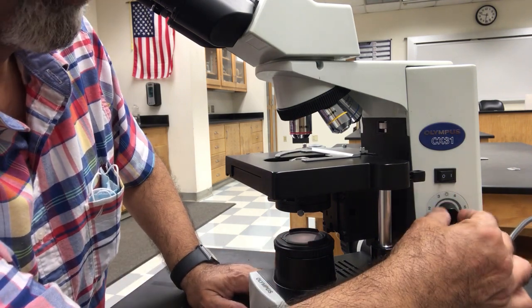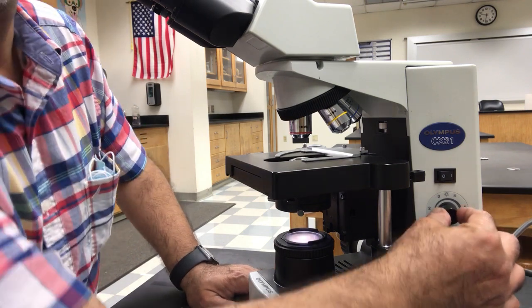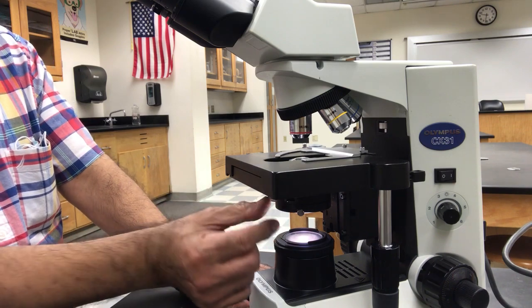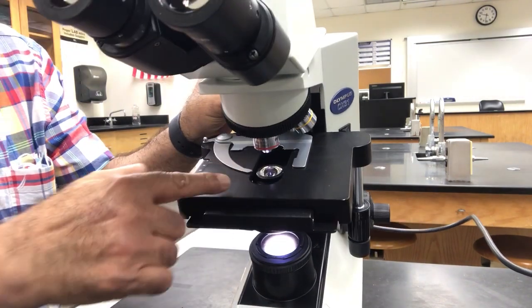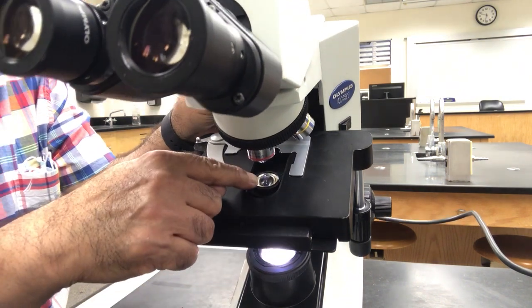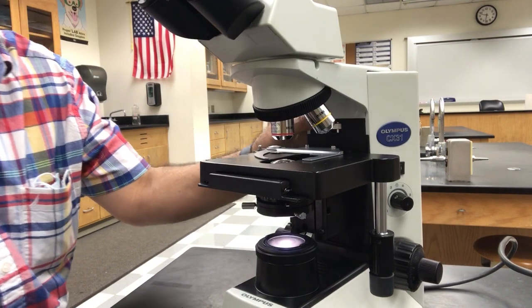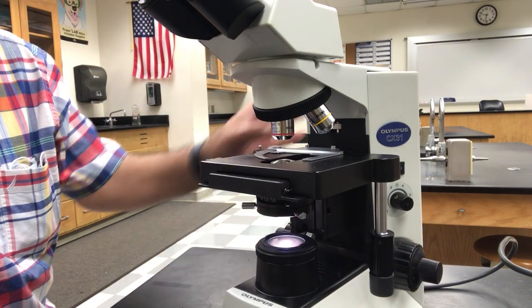This is the controller for the light. Go high and you can see the light coming, and the light goes to the condenser. You can see a lot of light coming through here now. And if I close the iris diaphragm, very minimal light would come here and create a contrast so we can see transparent objects.